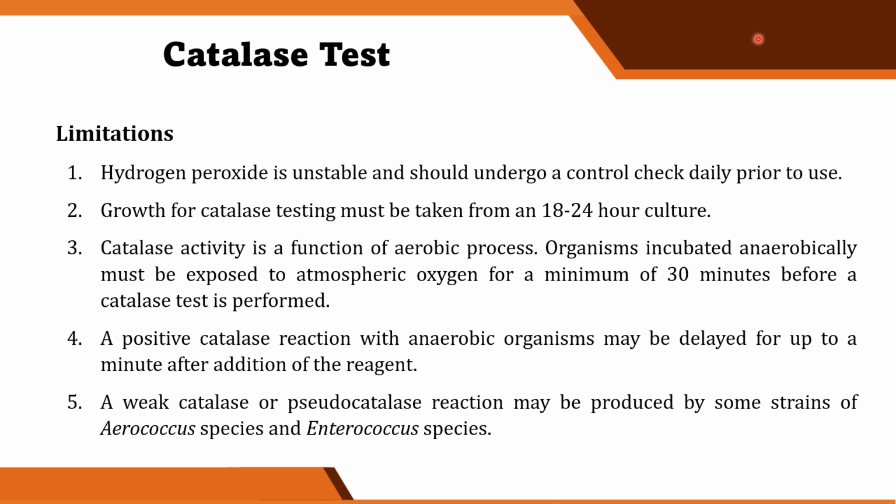So, what are the limitations of our catalase test? Number 1, hydrogen peroxide is unstable and should undergo a control check daily prior to use. Okay? So, if parang sira na pala yung hydrogen peroxide mo na nagamit, hindi na siya magre-react properly. So, false negative ang kalalabasan ng inyong test. Number 2, growth for catalase testing must be taken from an 18 to 24-hour culture only. Organisms lose their catalase activity with age, resulting in a false negative reaction.